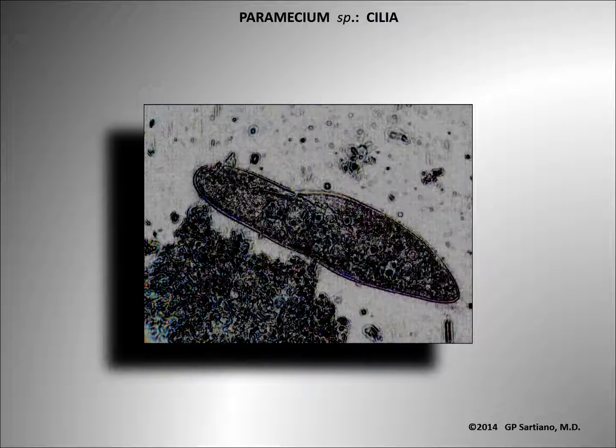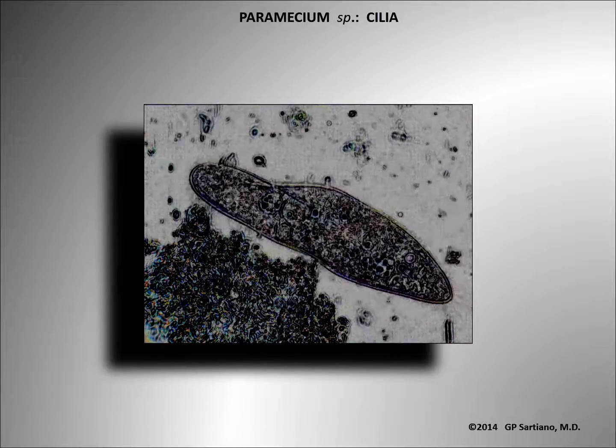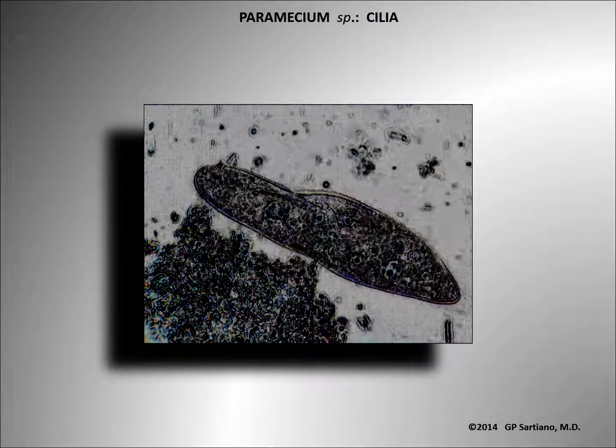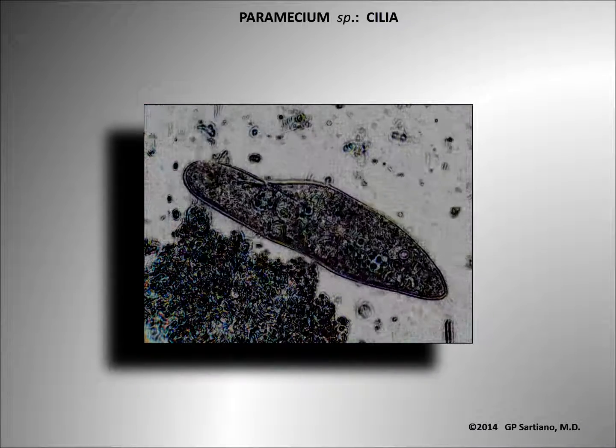This video demonstrates quite graphically the feeding currents and other currents generated in the surrounding medium by ciliary action.